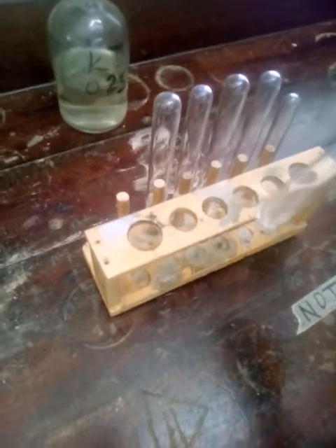Now we're going to acidify our potassium iodide by adding about 3 drops of dilute sulfuric acid. So we add 1, 2, 3. Our sulfuric acid was added, and we shake it a little. We observe that we're not getting any change in the medium when the potassium iodide is acidified.